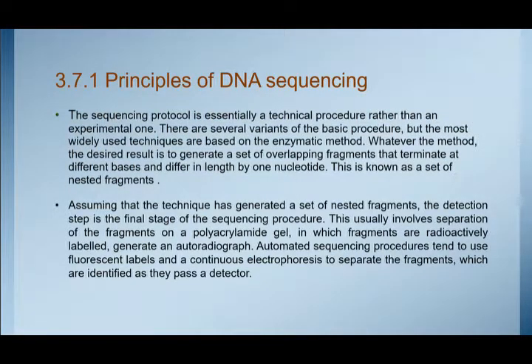Principles of DNA sequencing. The sequencing protocol is essentially a technical procedure rather than an experimental one. There are several variants of the basic procedure, but the most widely used techniques are based on the enzymatic method.